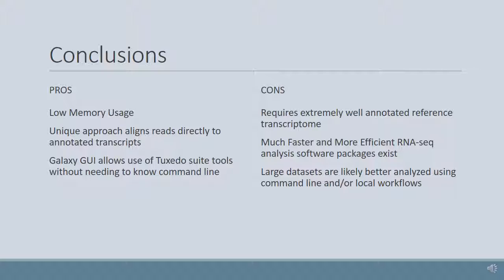So I would recommend it to whoever, and whenever you're using RNA-seq, if you feel like you have a good reference transcriptome, Tuxedo Suite is the way to go. All right.